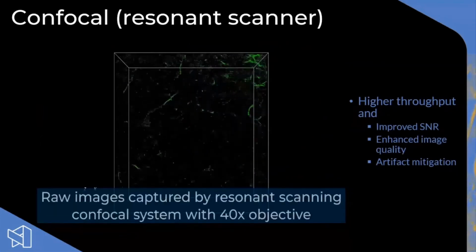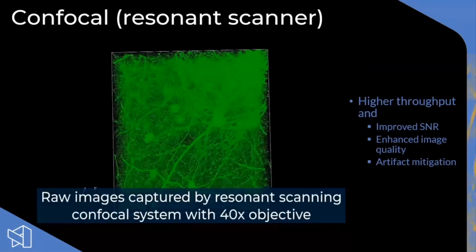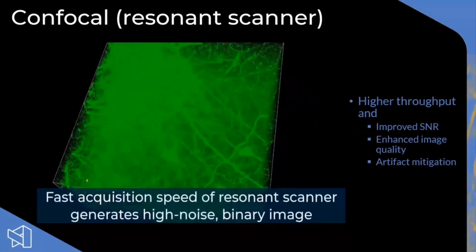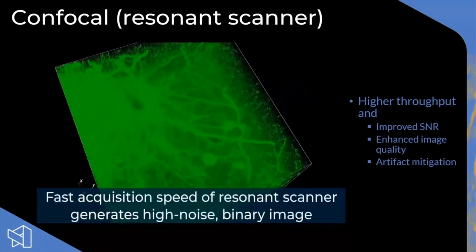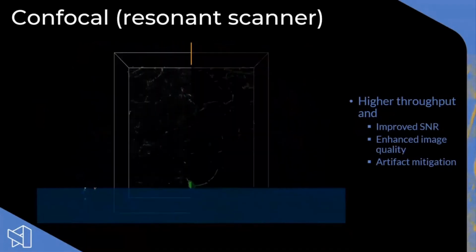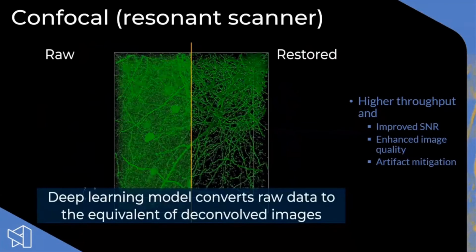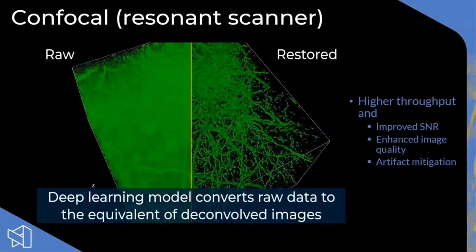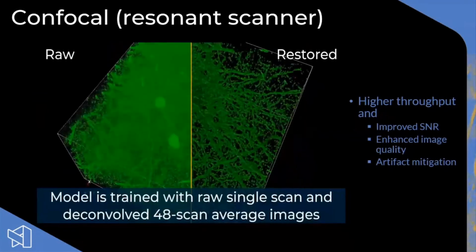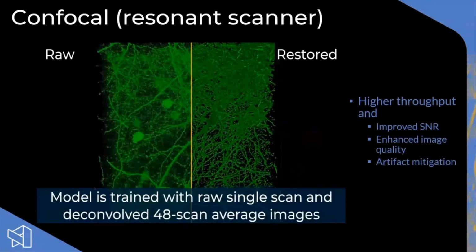So Hu Zhao was actually imaging with an SP8, a Leica SP8 resonance scanner, but doing lots of line averages and deconvolving, really beautiful images. But it was taking several days to image a whole mouse brain, so that's not practical. The computer would crash, the system would be unstable, the sample would dry up. I mean, all sorts of things. So his problem was it's taking too long, it's too error prone. So he needed to speed things up a lot.